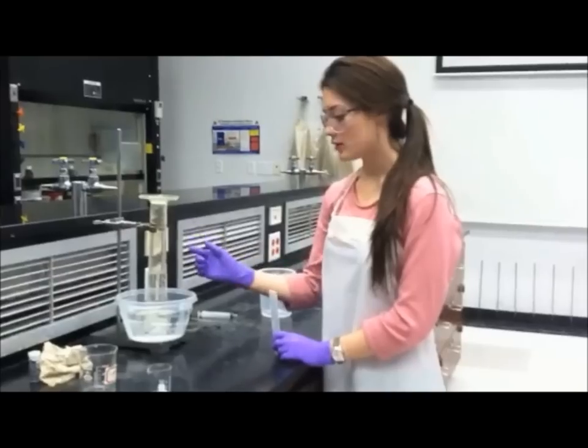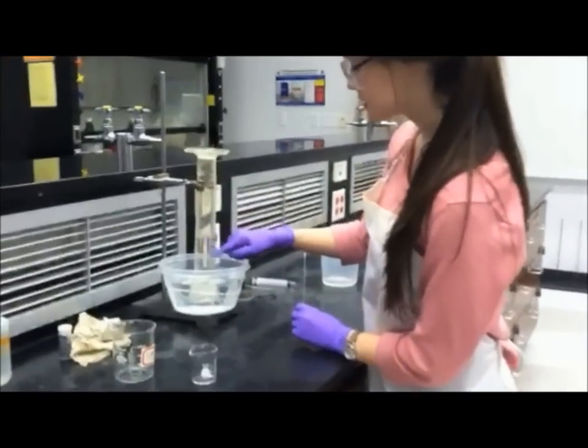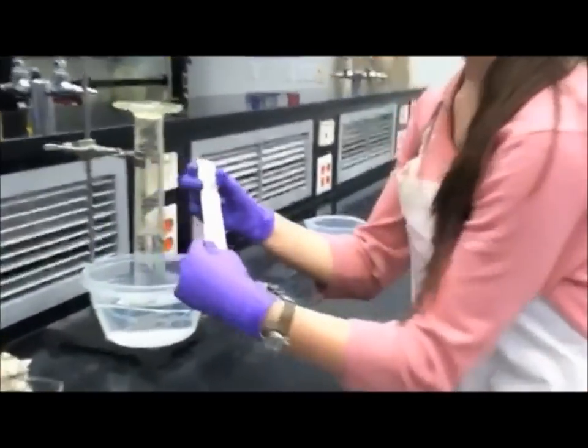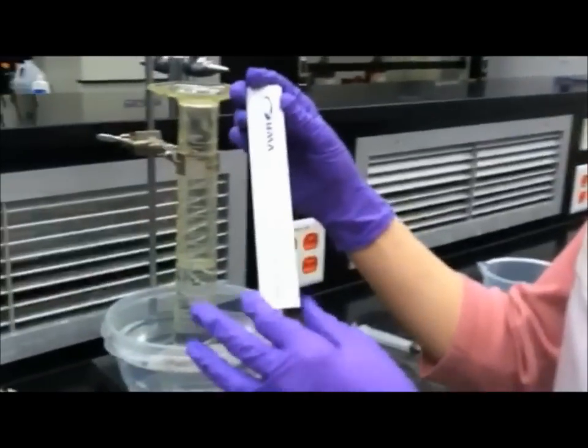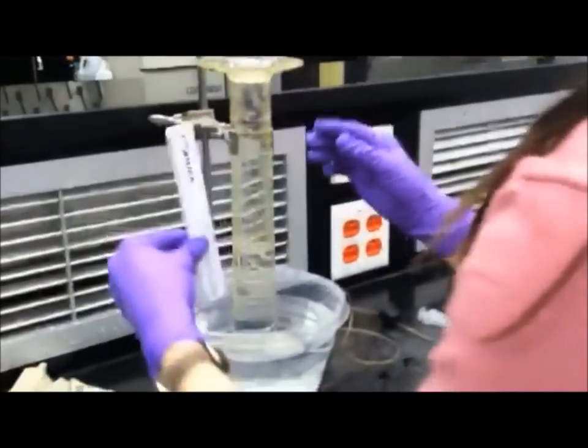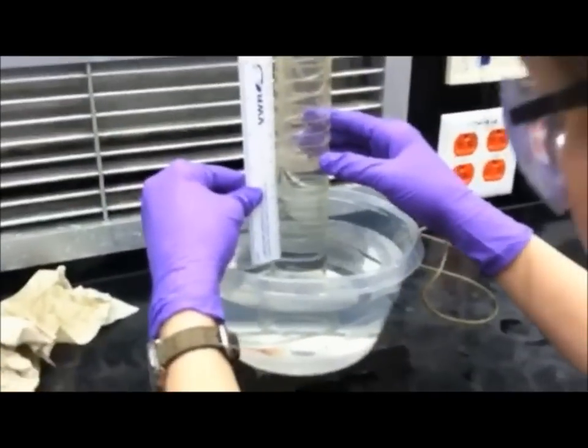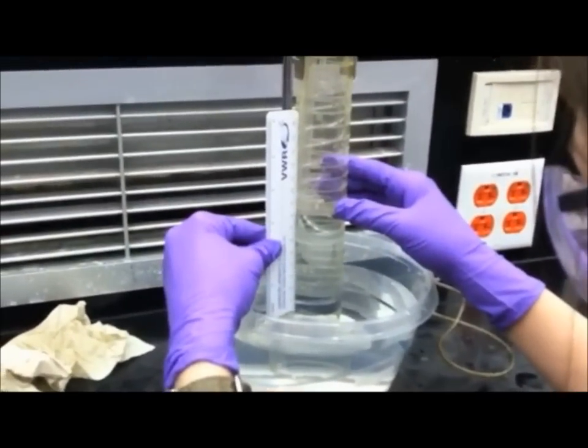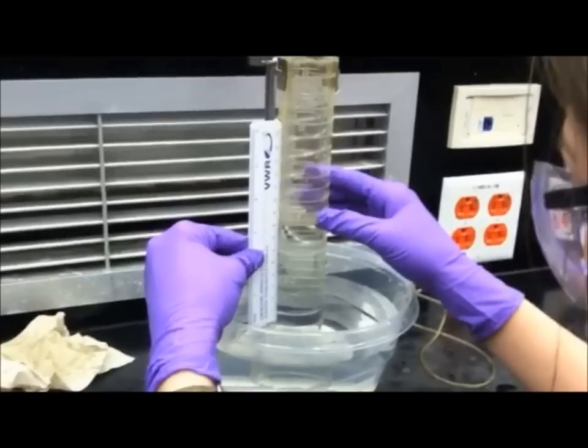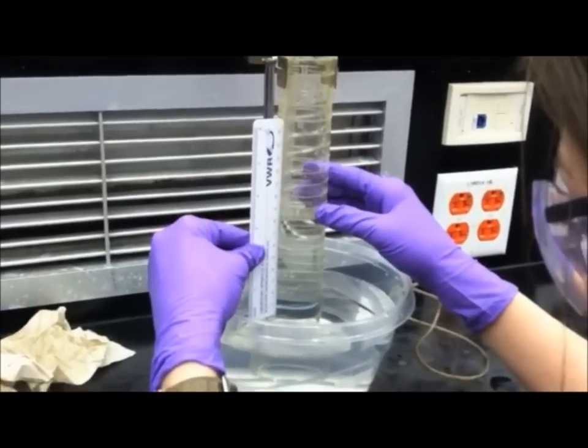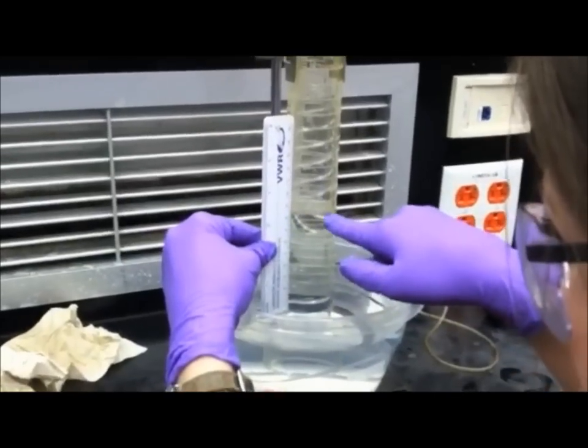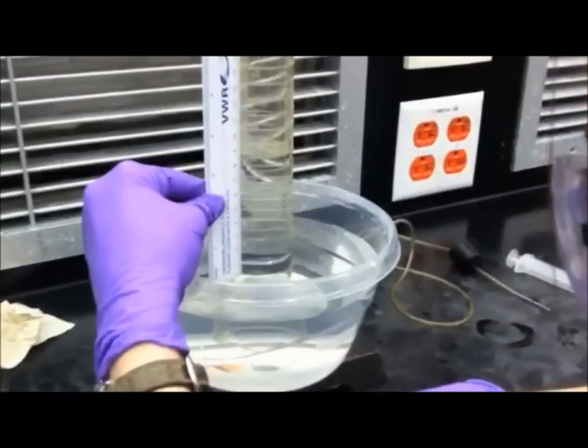So now to measure the height difference between the water bath and the graduated cylinder. The easiest way to do this is by taking a centimeter ruler and measuring very closely the difference in the two water levels by lining up the end of the ruler at the surface of the water. And then, as you can see, for ours, it is about 8.43.